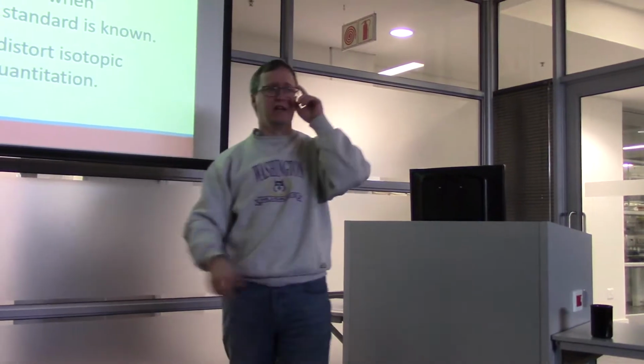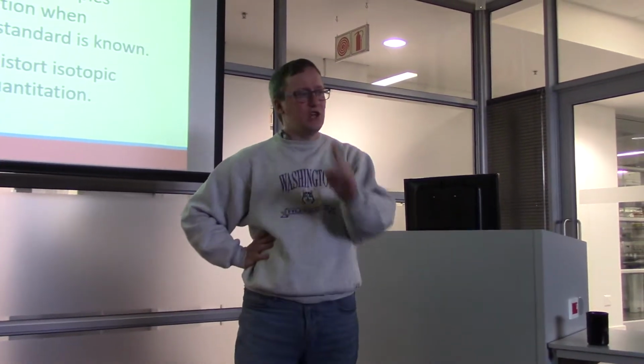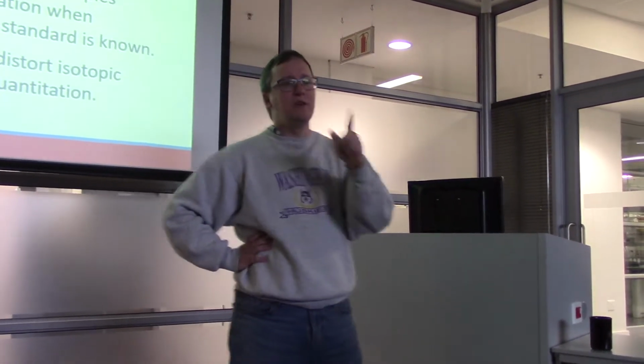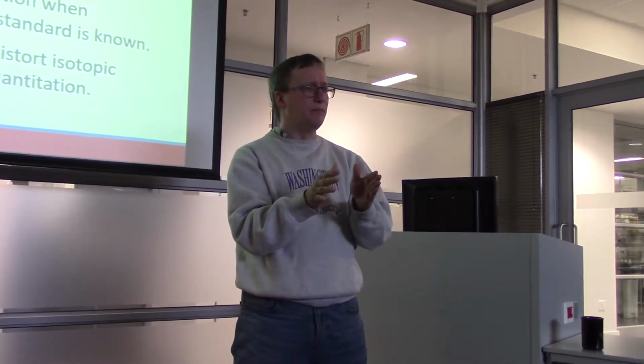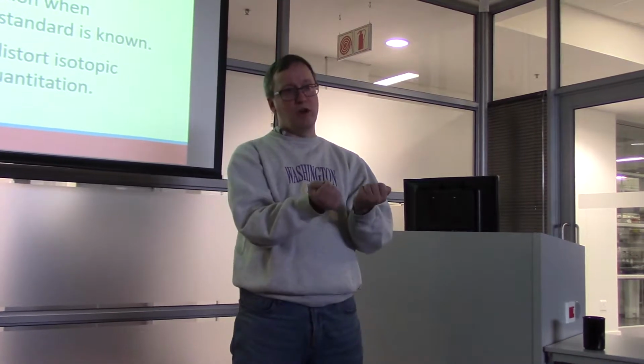Okay, so the idea here is that those extra neutrons we're adding do not change the biochemical behavior of that peptide. So imagine that you have a labeled sample and an unlabeled sample. One you digested in heavy water, one you digested in ordinary water.